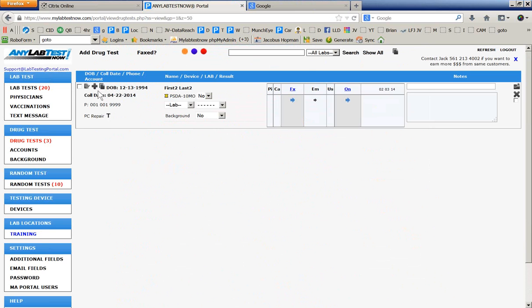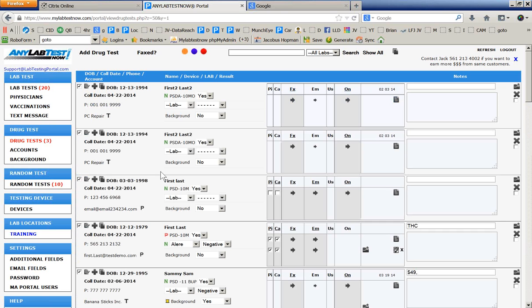And what is done, you want to go to test performed, yes. You see this? No, yes. And then you report it in the usual way. And once you have reported it in the usual way, you check it off. Does everybody get this step?